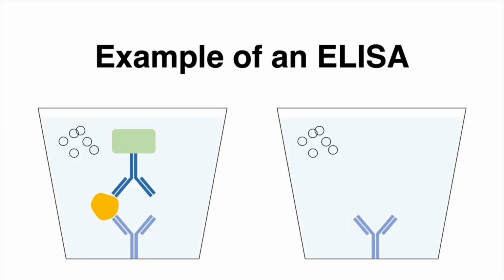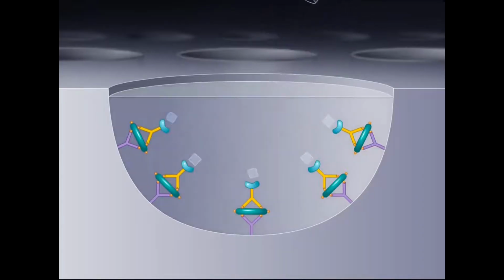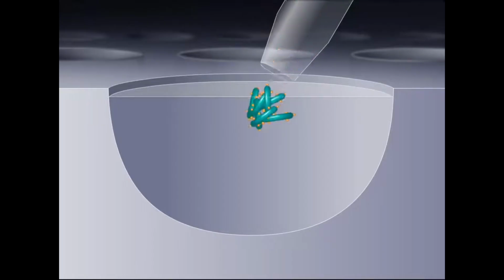Now, primary antibody. Step 3 is adding primary antibody. The primary antibody is added and will be bound only if there is any recognized epitope within the sample antigen. And next, step 4 is the secondary antibody. An enzyme-linked secondary antibody is added with suitable dilution, which will bind to any available primary antibody. Secondary antibodies are linked to the enzyme through bioconjugate. The plate is washed with buffer or mild detergent to remove any unbound antibody or proteins.